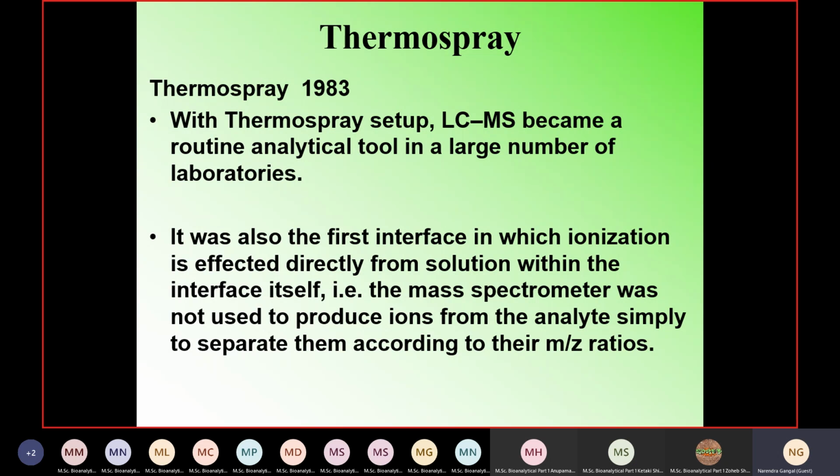So this was the thermospray, as I said, is clear just now. 1 ml of a liquid and 1 ml of a gas, what is the difference? Because the liquid generates a large quantity of water vapor, and 1 mole generates how much water vapor? 1 mole of water, how much volume does it generate? 22.4 liters. That's huge.